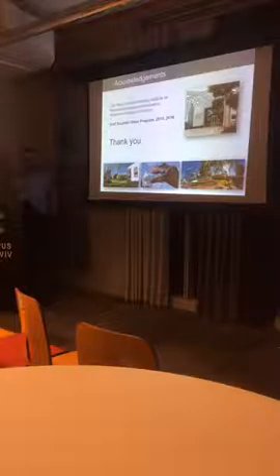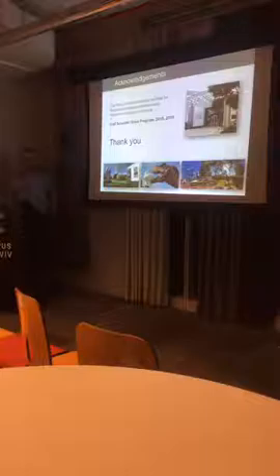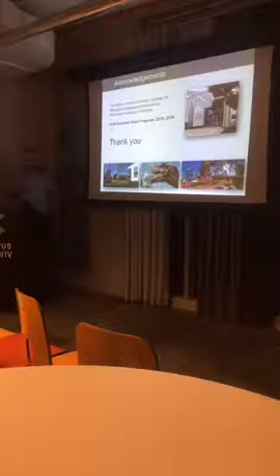Same issue. Even with the mouse, you have a problem of signal to noise, very low intensity, and a lot of noise from the camera and so on. All the problems that we have, we try to solve step by step. We have a problem of motion artifacts.